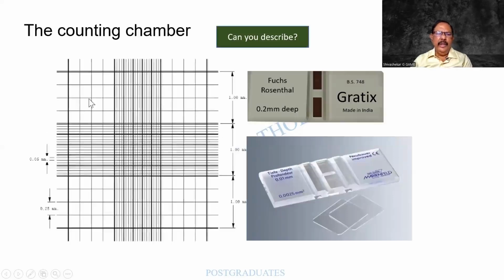Now, this is the age-old method of counting. The RBCs will be done in the middle, the WBCs over here. And it is these 4 squares that are used for the semen analysis. Basically, there are 2 types of chambers. One is the improved Neubauer chamber. I'm not going into the details of it, but then there is another chamber called the Fuchs-Rosenthal chamber.